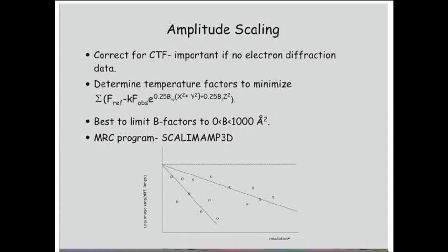First of all, you've got the fall-off of the envelope of the contrast transfer function due to limited coherence, for example. You could have a poorly ordered crystal. You could have sample movement in different directions, blurring your image. As you tilt your crystals, lack of flatness becomes more of a problem, and that manifests itself as blurring of spots. So you can end up with rather poorly measured, weak amplitudes, and the way those amplitudes fall off may be different in different directions.